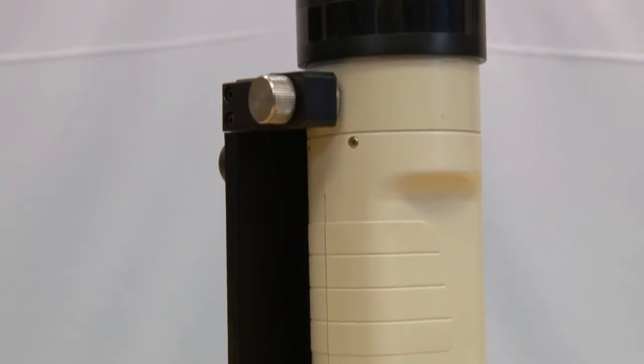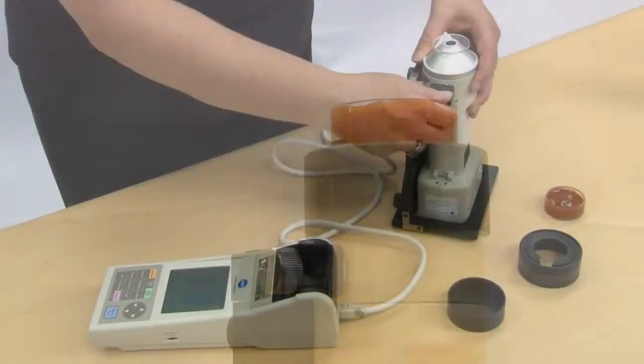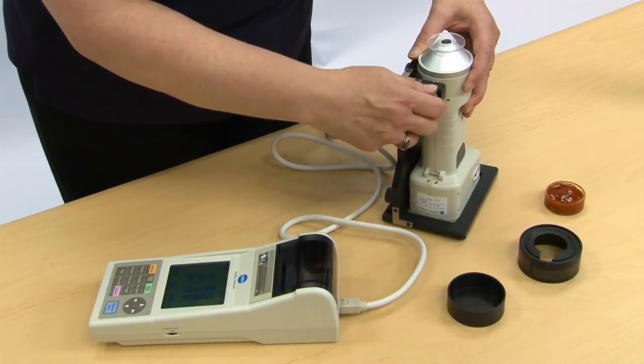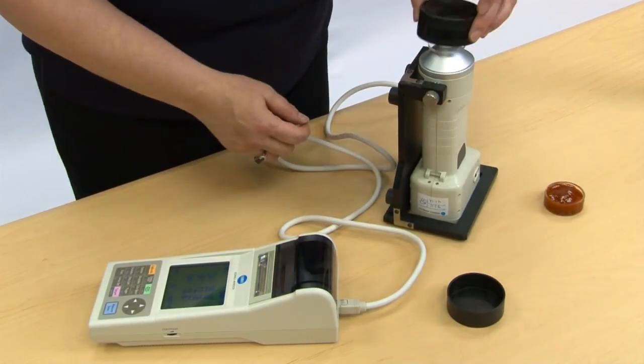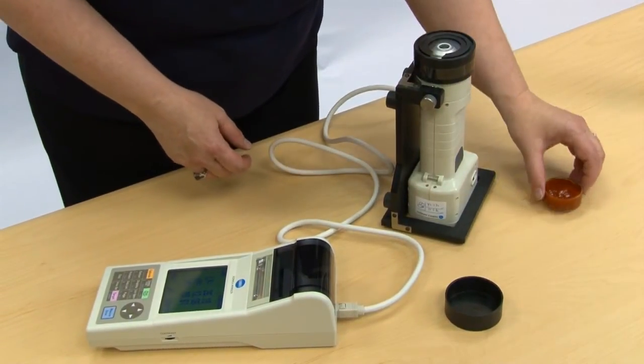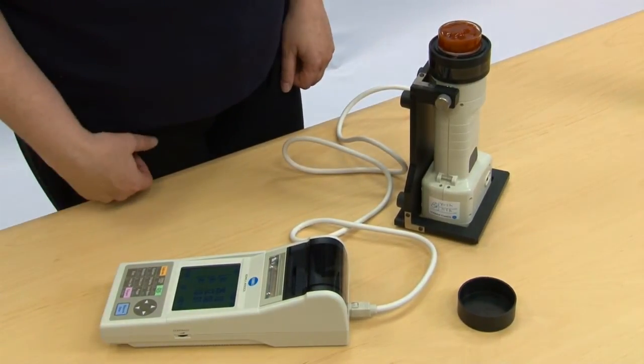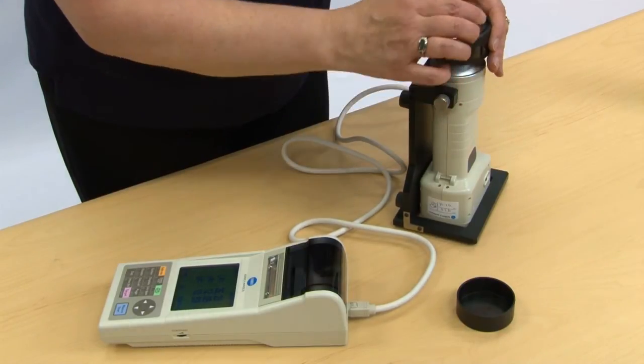The CR400 petri dish holder allows for the measurement of granular, paste, powders, and liquids. Simply place the sample to be measured in the petri dish and measure. It can be used with or without the cap placed on the petri dish holder, depending on the sample type.